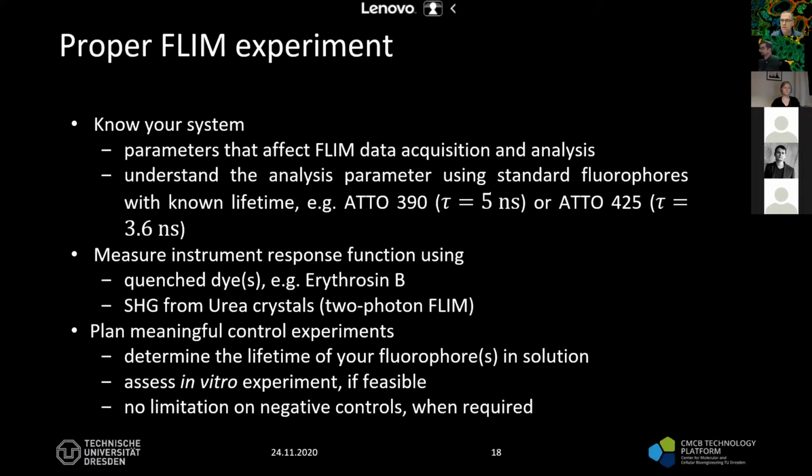Lifetime value varies. You measure it in your lab for the same fluorophore; if I measure in my lab with my instrument, it will be different. For example, labs measure lifetime differently. For cerulean, the reference is 3 nanoseconds, but we always measure 2.8 nanoseconds. In lifetime measurement, the reproducibility of the data is very important. You cannot compare one lab to another lab, though the difference may not be that large.